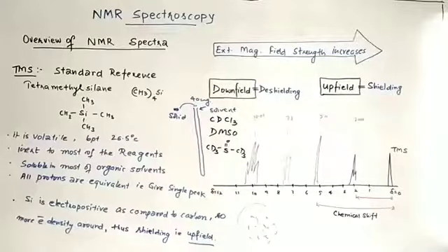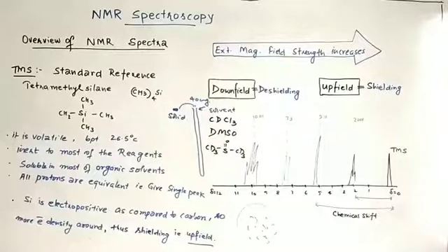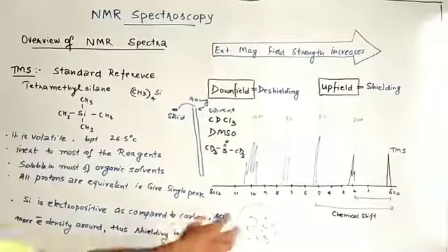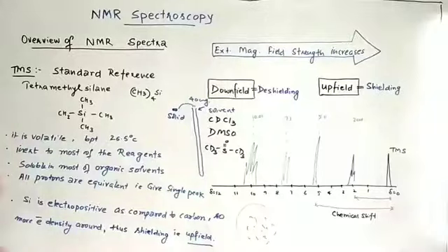Why some protons flip at higher field and why some flip at lower field, that we will discuss after we discuss equivalent or non-equivalent protons. Then there are some factors which affect these upfield and downfield shifts, and the inductive effect is one of them. We will discuss that.